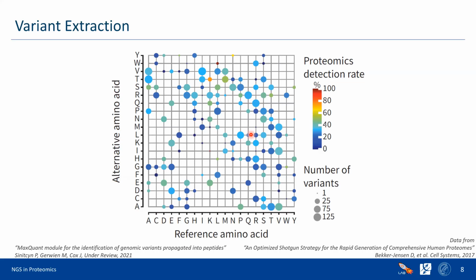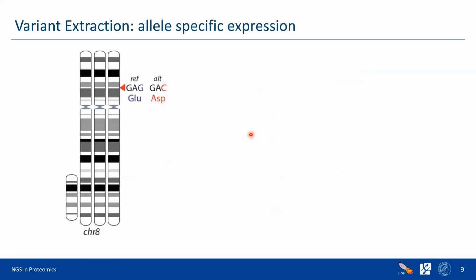Yeah, cool. So what can we do more? As I said, there are a few very cool applications which we can explore. For example, one application is allele specific expression. I have to say, here we are discussing allele specific expression due to copy number variation changes. And of course, maybe many of you know that the HeLa cell line is really famous for that.